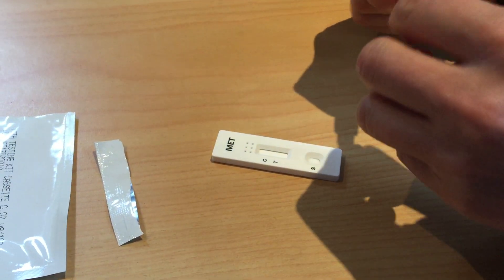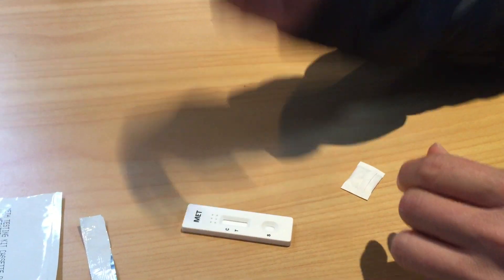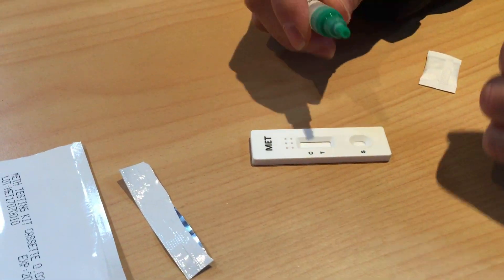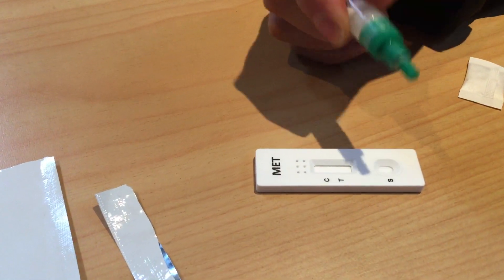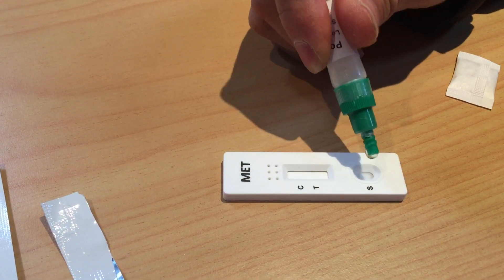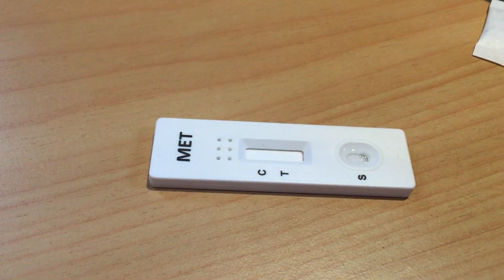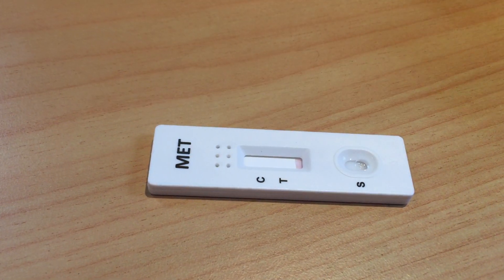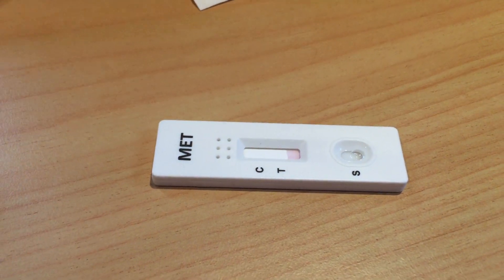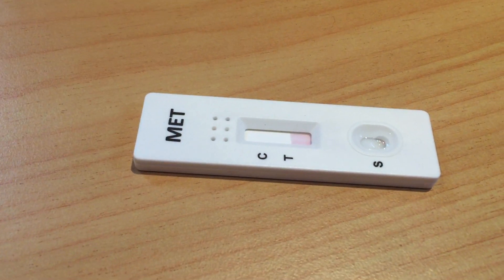I'm just going to quickly shake this one to get it all mixed. So this is clean — no contamination. We're going to put three drops on it: one, two, three — and see what it should look like when it's negative.